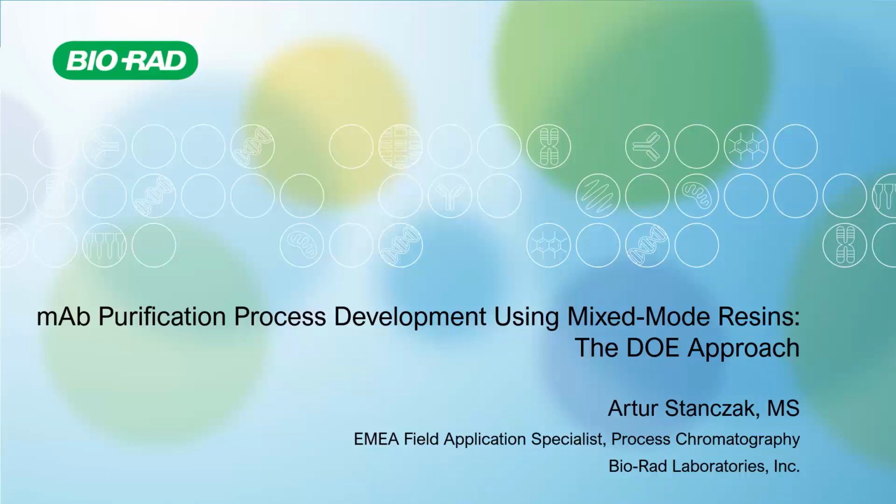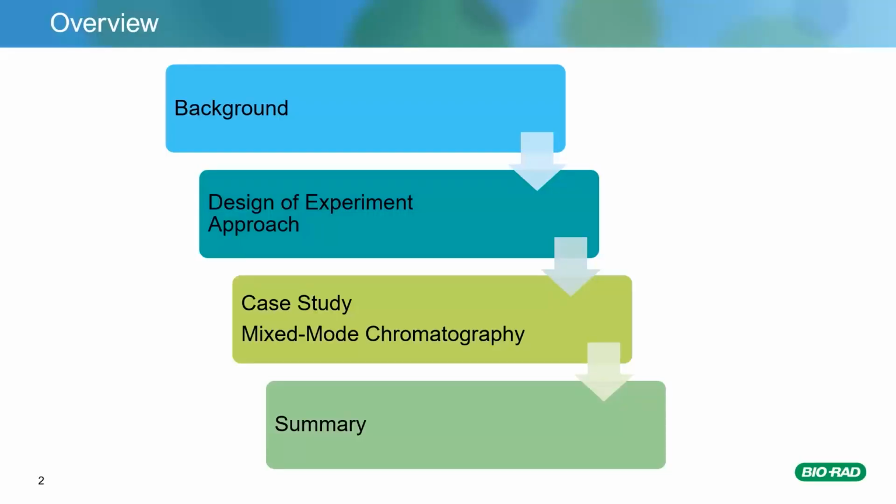I look forward to discussing today the monoclonal antibody purification process development using mixed-mode resins in the DOE approach. In the first part of my talk, I'm going to introduce you to quality by design concept, where it actually came from, why it's important, and how it's linked to the design of experiment. I will show you benefits of implementing DOE approach in your experimental work.